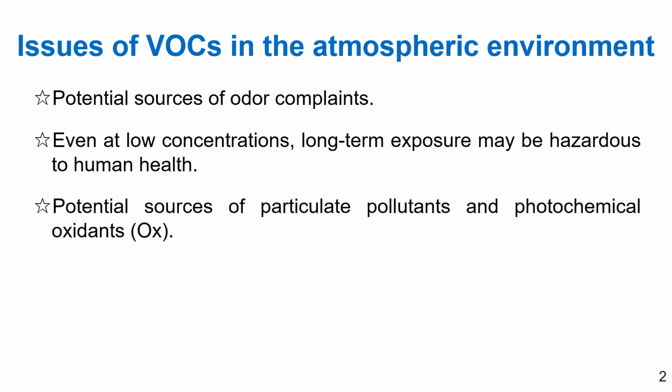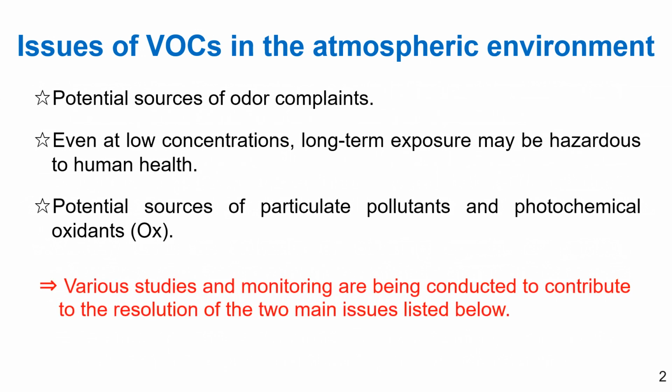Third, VOCs include potential sources of particulate pollutants and photochemical oxidants. Various studies and monitoring are being conducted to contribute to the resolution of the two main issues listed below.